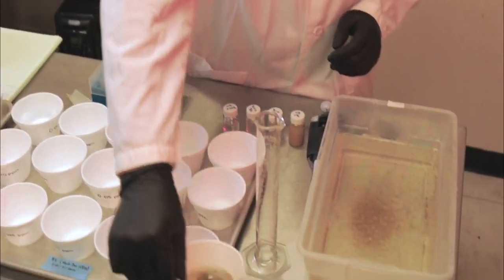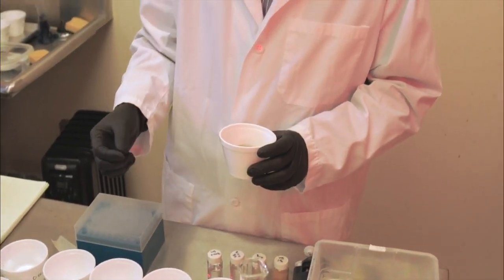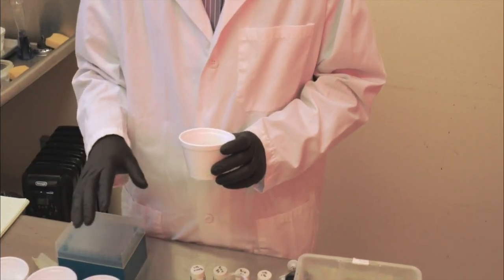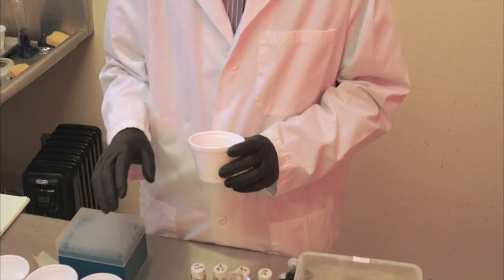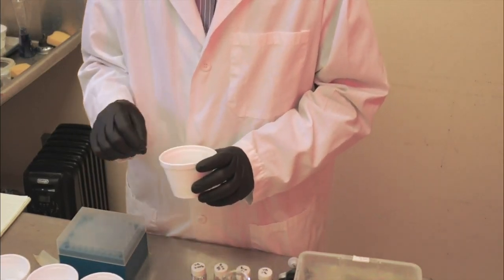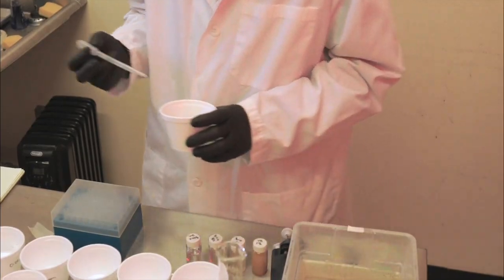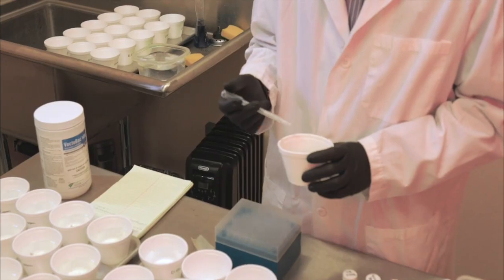After that, you can see this cup, we add some larval food to this assay for a couple of reasons. First, the larvae are growing, of course. We know BTI works by ingestion only, so the larvae have to feed in order to be killed. Adding this food material will promote their feeding behavior. Of course, if you add too much, it will increase microbial activity, and it may reduce the activity of BTI. So there is a certain amount.